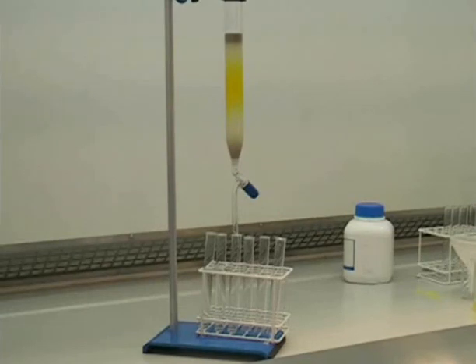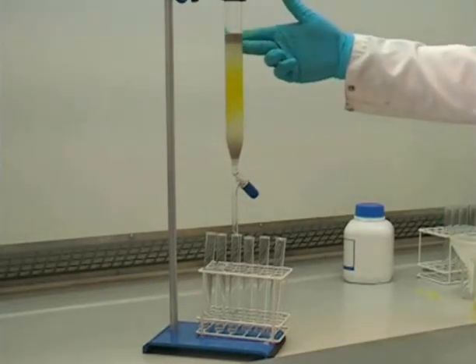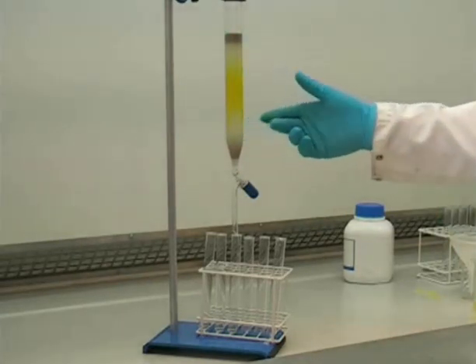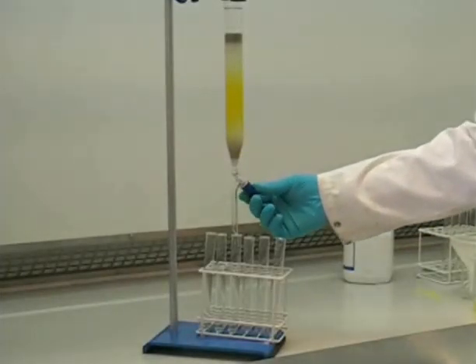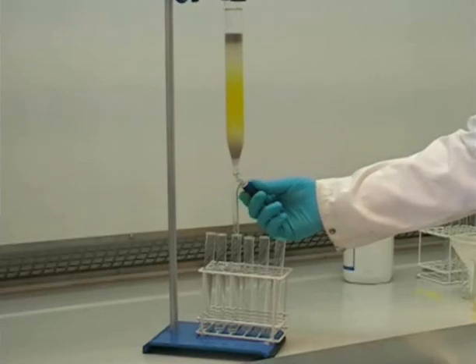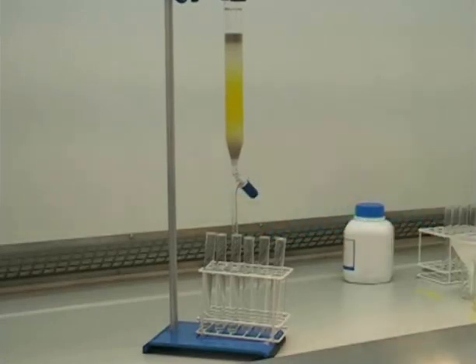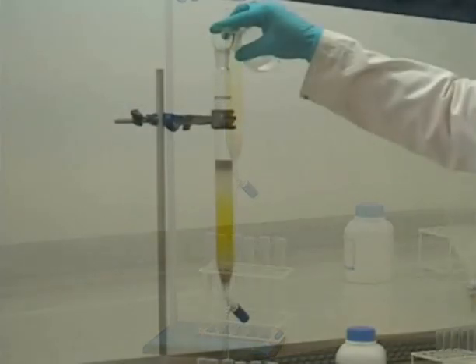Because our compound is coloured in this case, we can actually see it moving down the silica. This will give us a good indication as to when it's actually eluting from the column. In cases where you can't see the compound because of any colour, you can use TLC to analyse the fractions to identify the presence of different compounds.